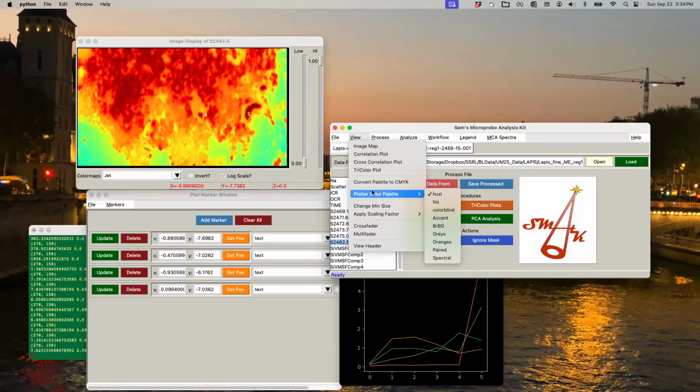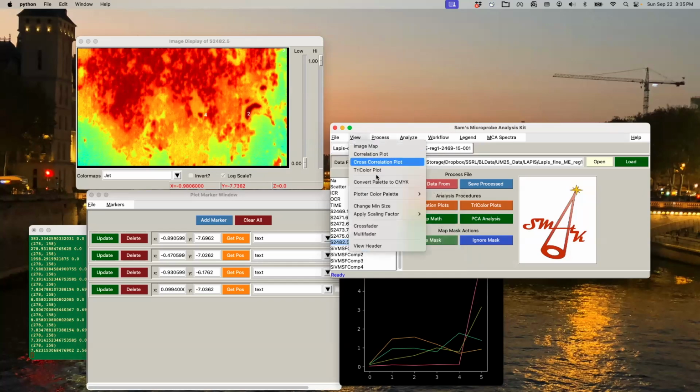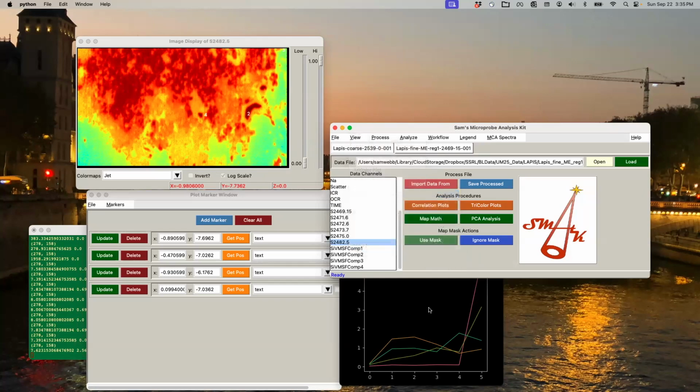Spectral is kind of the old-fashioned jet-y kind of way of going through things. This one's a pretty good one. I like it. We'll keep this on Husl though. So you can change your color palettes. I'm not sure if it redraws it. Probably won't until next time, no. But I like this one here. So hopefully you can see your lines better.